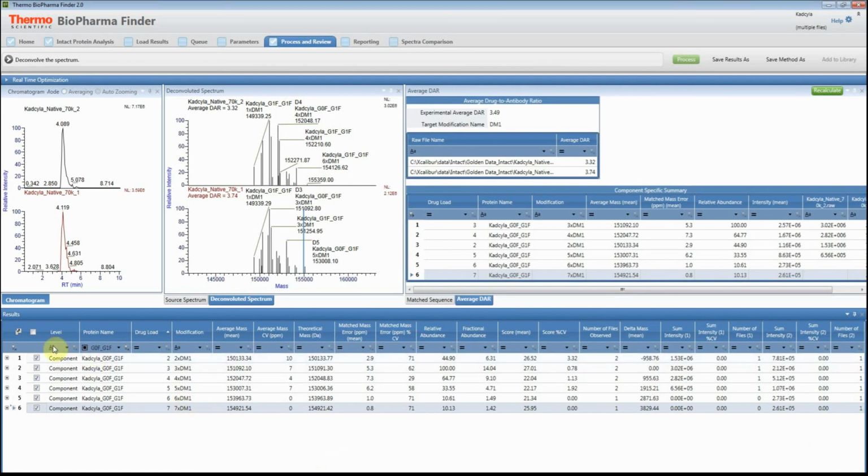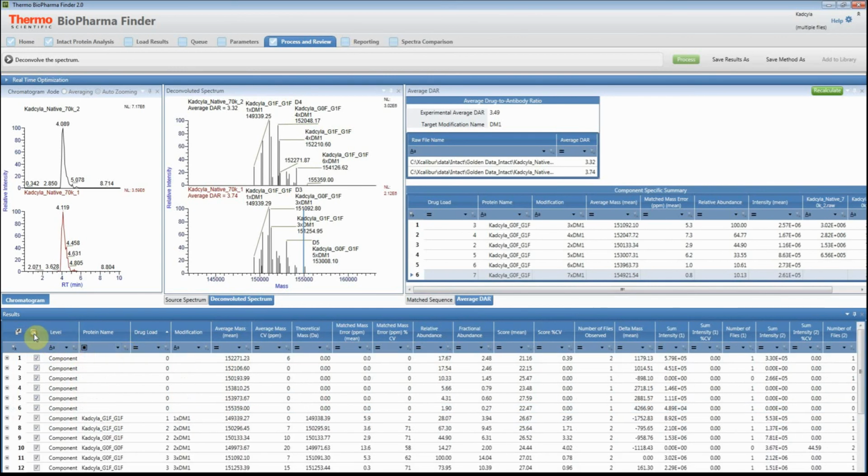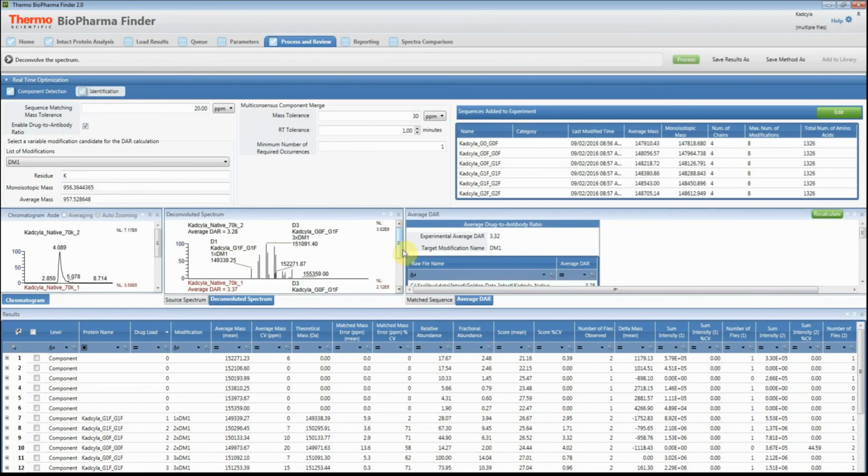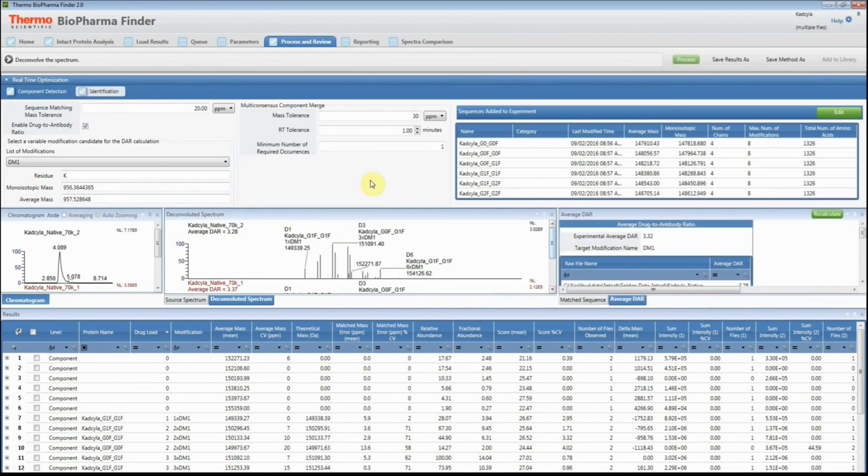And then to get back, you can simply just clear this. Okay, and then you could just check them all or hit recalculate, and it will take you back to the defaults. And then you have the completed. So what's nice though is, as you see these, and you can see how quickly that did process, you can now adjust the parameters. So you say, okay, well now this looks pretty good.